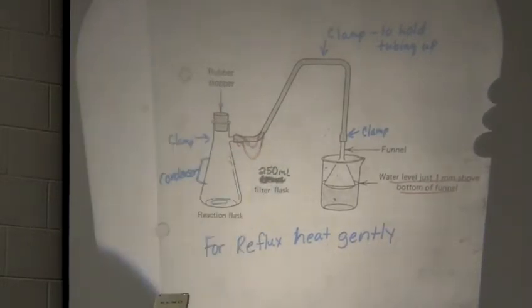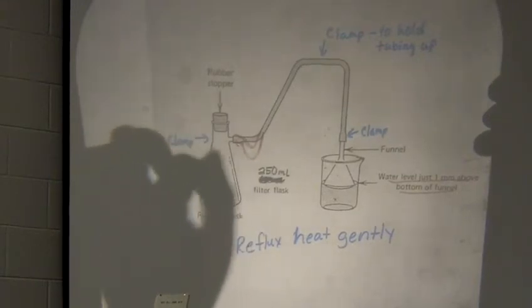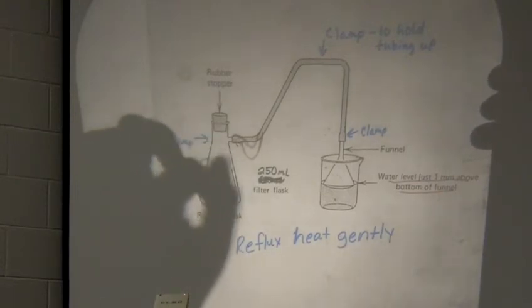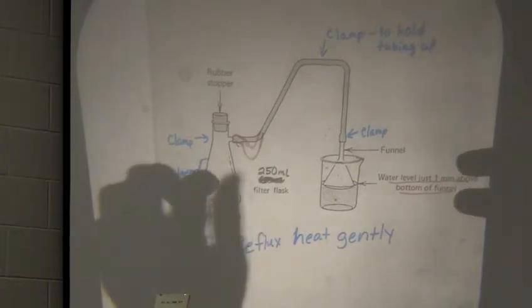For the people that are doing the reaction at 0 degrees, you're going to start in an ice bath, okay, and then stay there, okay? So you will set your reaction up in your pan, make sure everything's nice and flat, and then put ice around it. So I wouldn't take your pan of ice, try and put your Erlenmeyer in it. It's not going to sit nice and flat. You want to put the pan under the Erlenmeyer, then use another container to put the ice around your Erlenmeyer flask, okay?